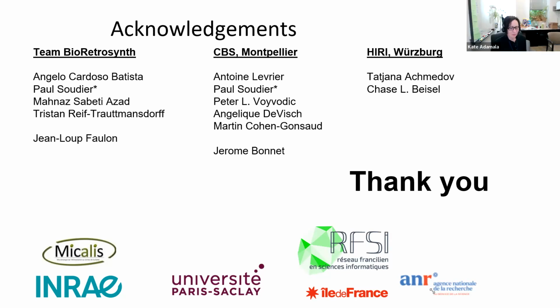Yeah, that's a very good point. We didn't optimize it. We used the published concentration, and we switched to using a knockout extract just like you guys now. So yes, I saw the Akabi paper. So we don't use GAMS anymore either. But I'm glad to hear that other people were struggling with it too.